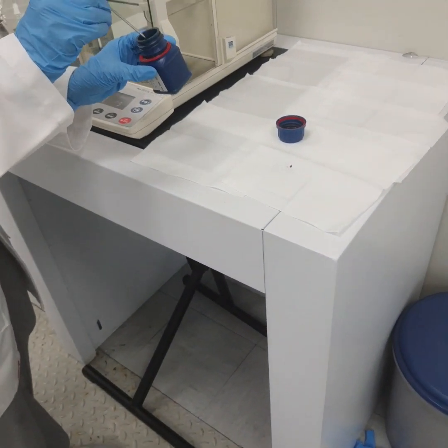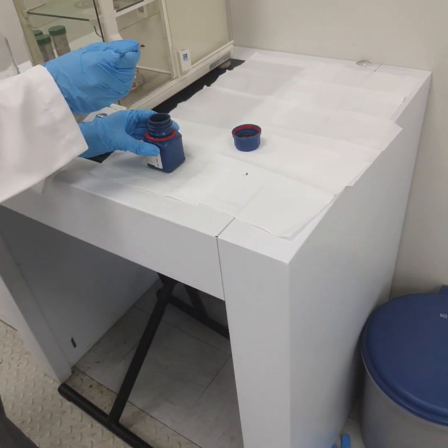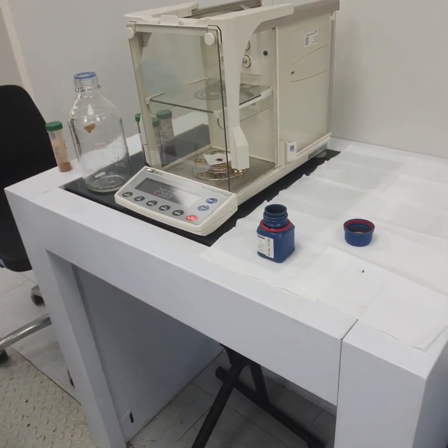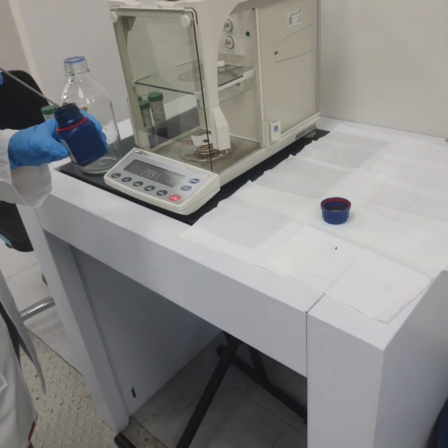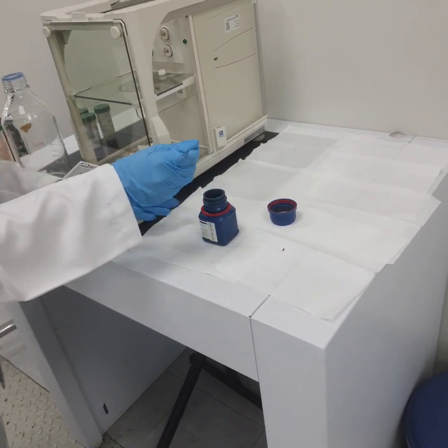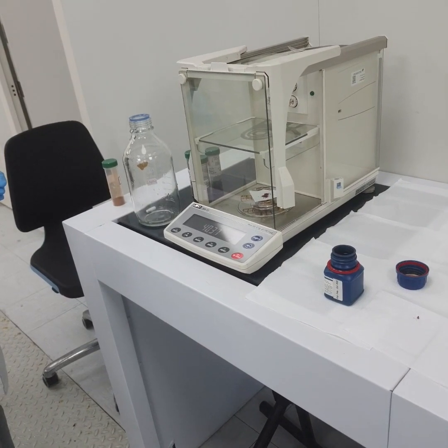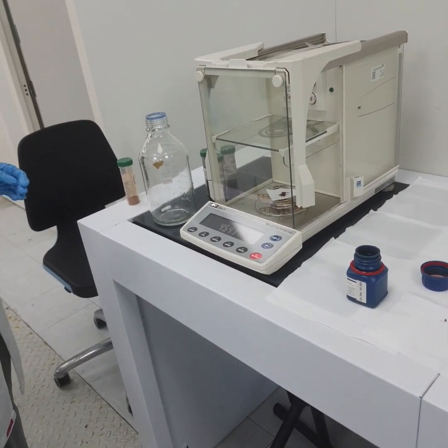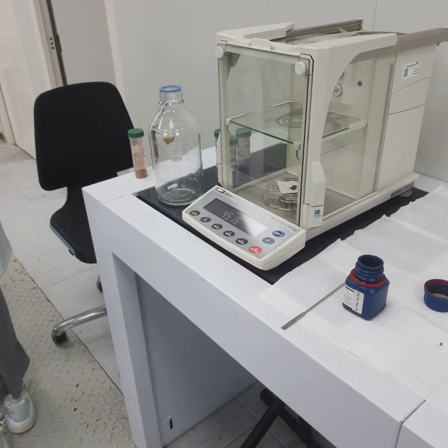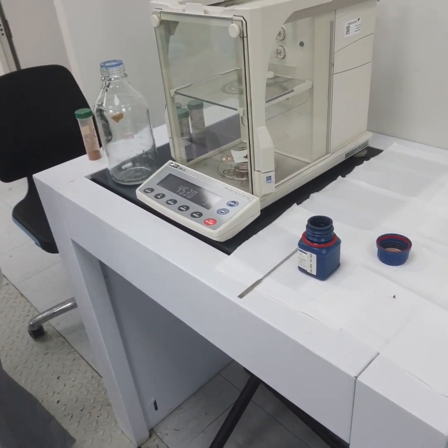So let's weigh around maybe 30 to 40. Yes, more. Just wait. Okay, just close. So this is around 45, you can say 45.16, so it's around 45 ppm. Now just close the dye.